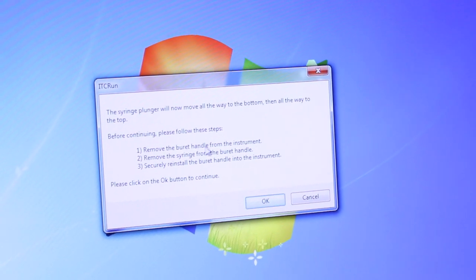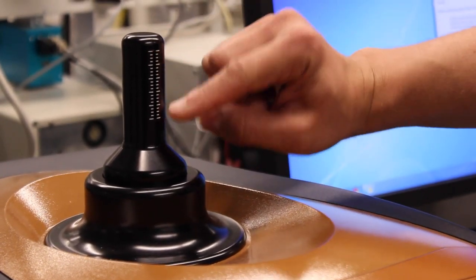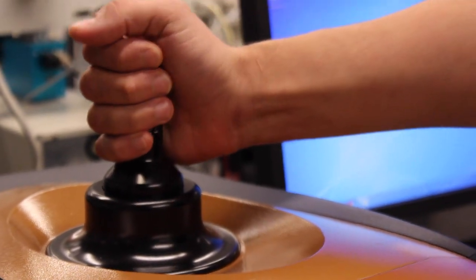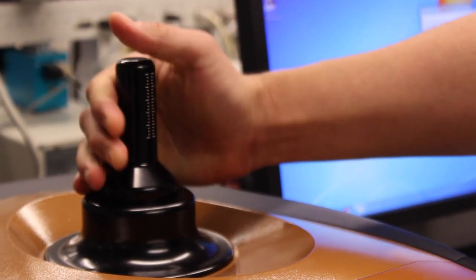Step one, remove the burette handle from the instrument. That refers to this part right here. This is the burette and this burette handle. To remove it, you need to push it down with some force and rotate it so that it unlocks and then you can pull out the burette handle.